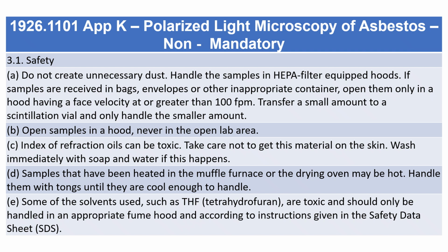C. Index of refraction oils can be toxic. Take care not to get this material on the skin. Wash immediately with soap and water if this happens. D. Samples that have been heated in the muffle furnace or the drying oven may be hot. Handle them with tongs until they are cool enough to handle. E. Some of the solvents used, such as THF, tetrahydrofuran, are toxic and should only be handled in an appropriate fume hood and according to instructions given in the safety data sheet.